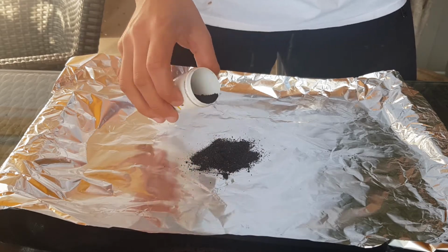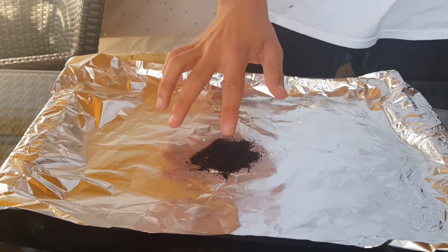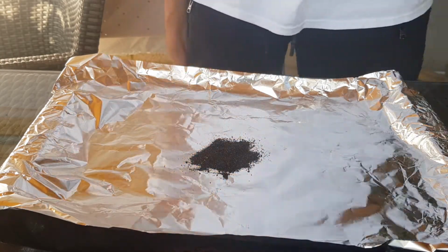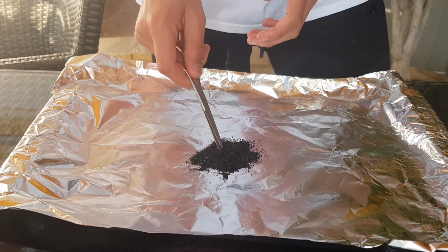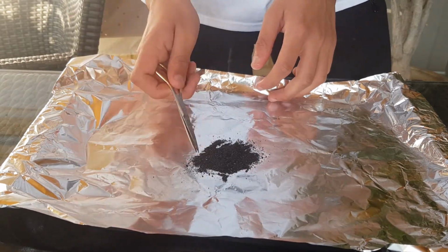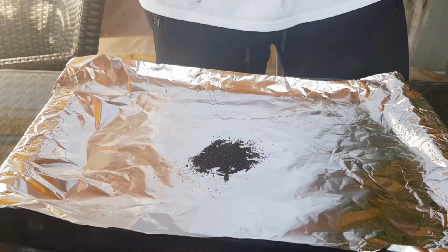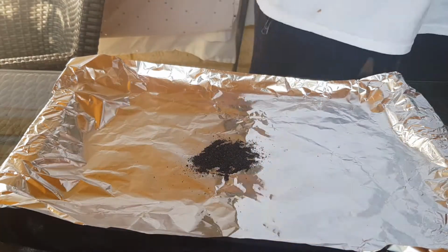You can see it's got those solid chunks sometimes, which is just annoying. More than anything, it's not dangerous. So this is sometimes used to start campfires, interestingly. It's quite a violent reaction to use while camping, but I'm not one to judge. I'm just gonna wipe that down.